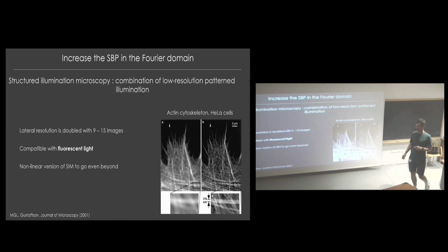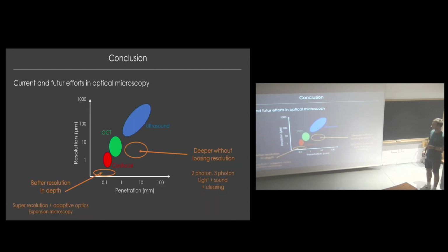There are also some non-linear versions of structured illumination microscopy to multiply the resolution by 3, 4, 5, but you need a huge number of images, and this is not as practical as linear structured illumination. And so this leads me to my conclusion.